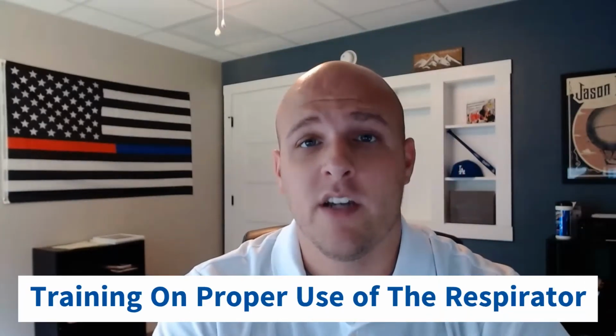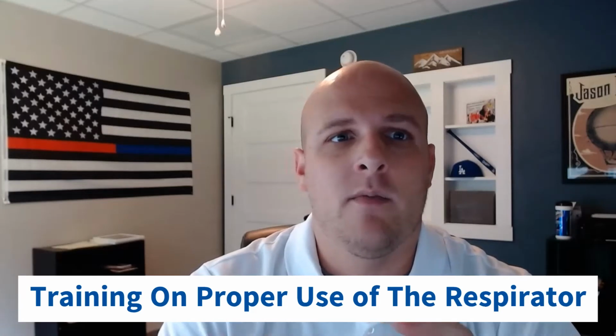Now, training on the respirator use. If I'm getting ready to do a respirator fit test, that's not the time to do a formal respiratory protection training for that person wearing the respirator. Now, if I want to do it beforehand, sure, I can do that. But if I'm just calling somebody and saying, hey, it's time for your fit test, come on in here, we'll do it, that's not the time to do it. But what I can do is show them. It should be a refresher, just a quick review. It's not formal.